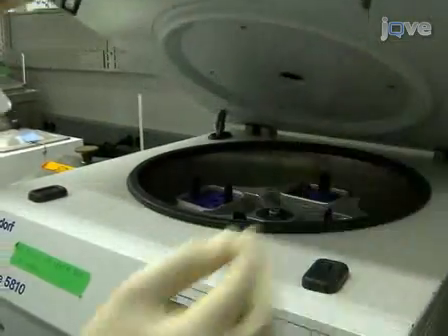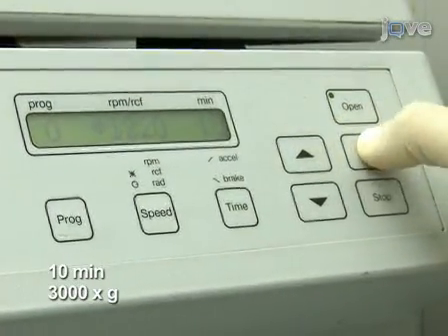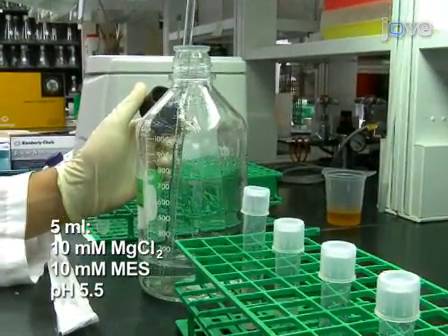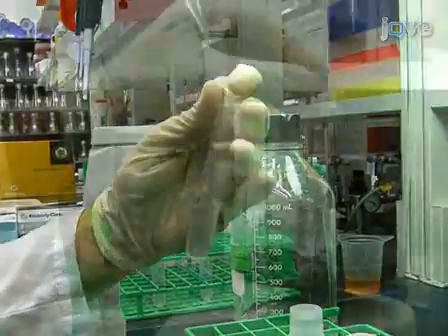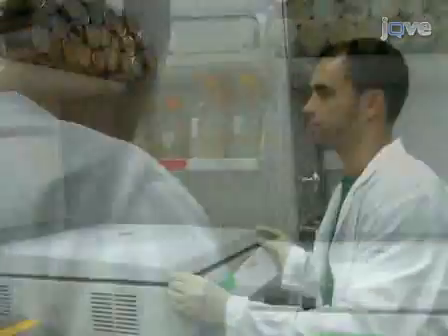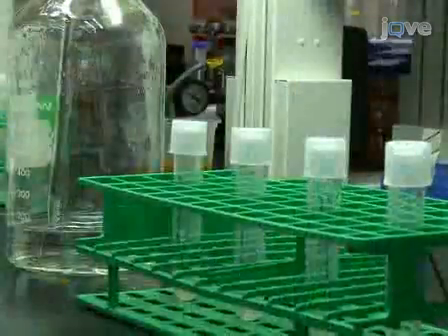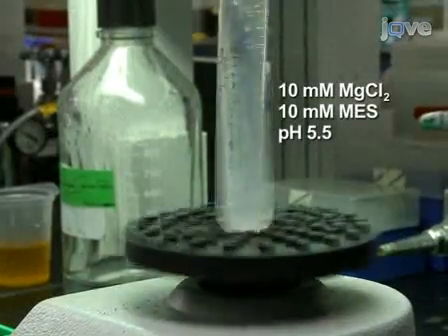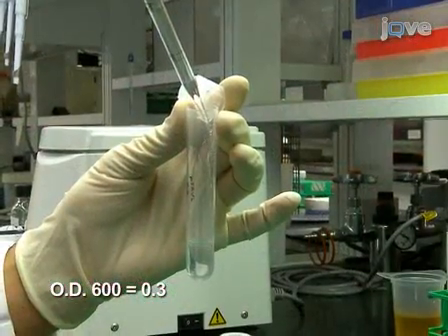Incubate the cultures at 30 degrees Celsius with shaking at 200 RPM for 20 to 24 hours. The next day, harvest the cells by centrifugation for 10 minutes at 3000 g. After removing the supernatant, add 5 milliliters of 10 millimolar magnesium chloride, 10 millimolar MES pH 5.5 to the pellet and resuspend the cells by gentle vortexing. Centrifuge the cells again for 10 minutes at 3000 g, then resuspend the cells in half the volume of the original culture with the magnesium chloride MES solution.